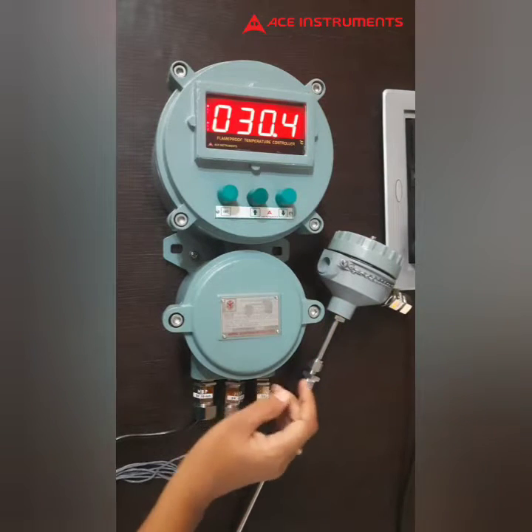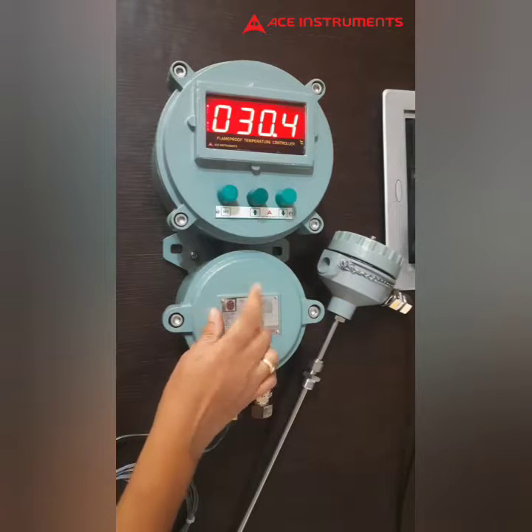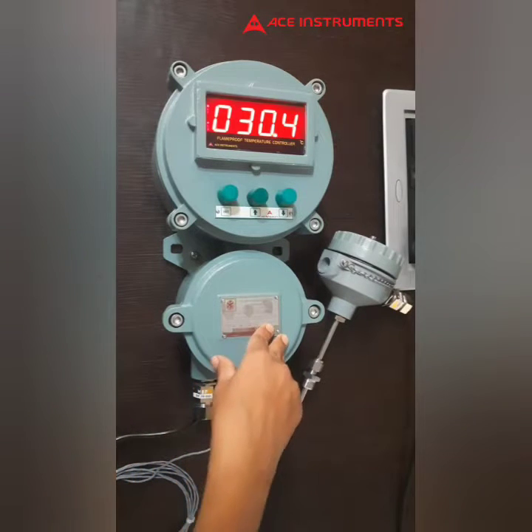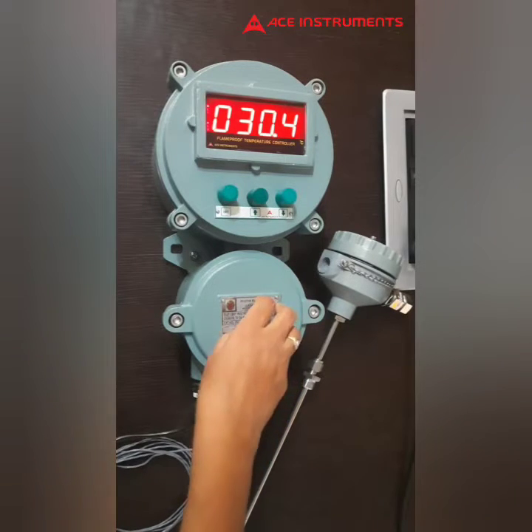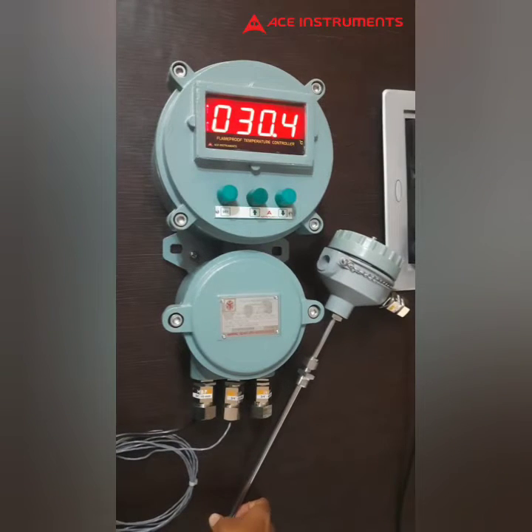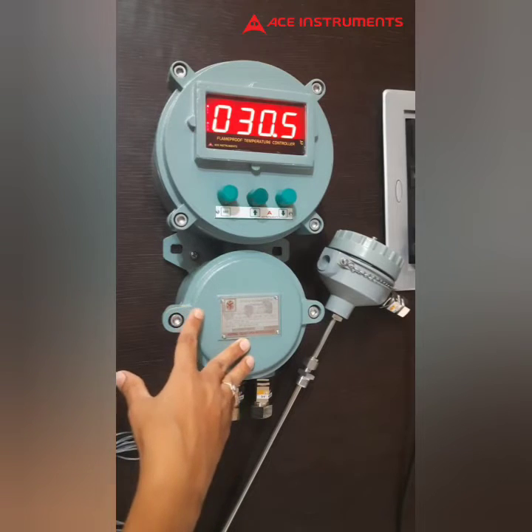Coming to the controller, this is a one-inch four-digit seven-segment red LED display. There's a special feature in it — this instrument has two relays, that is two set points, with NO, CO, and NC contacts. Two sets of NO, CO, and NC. Also, inputs can be customizable in this product.